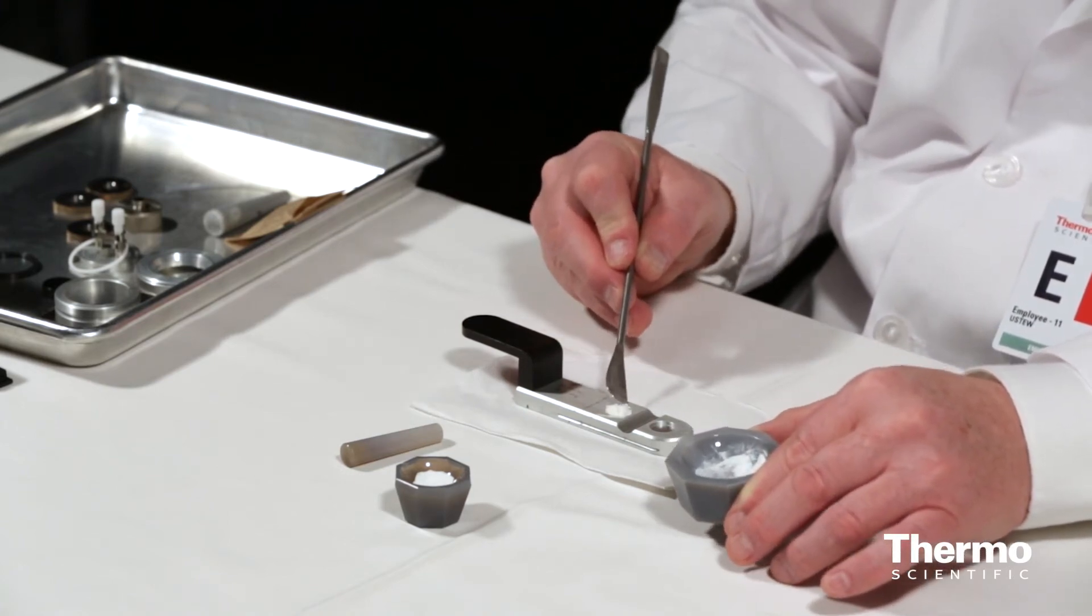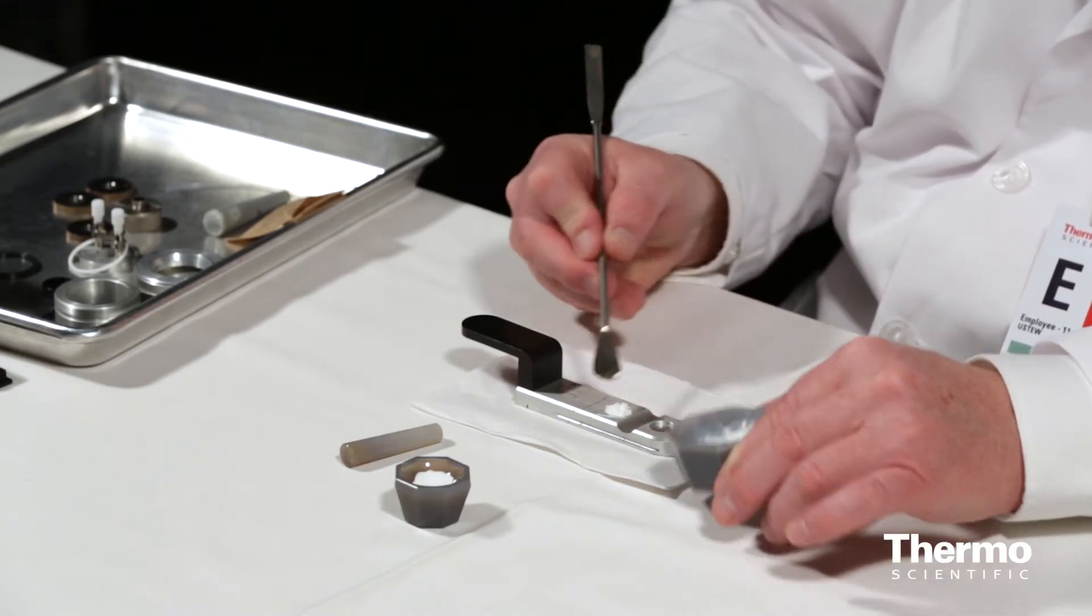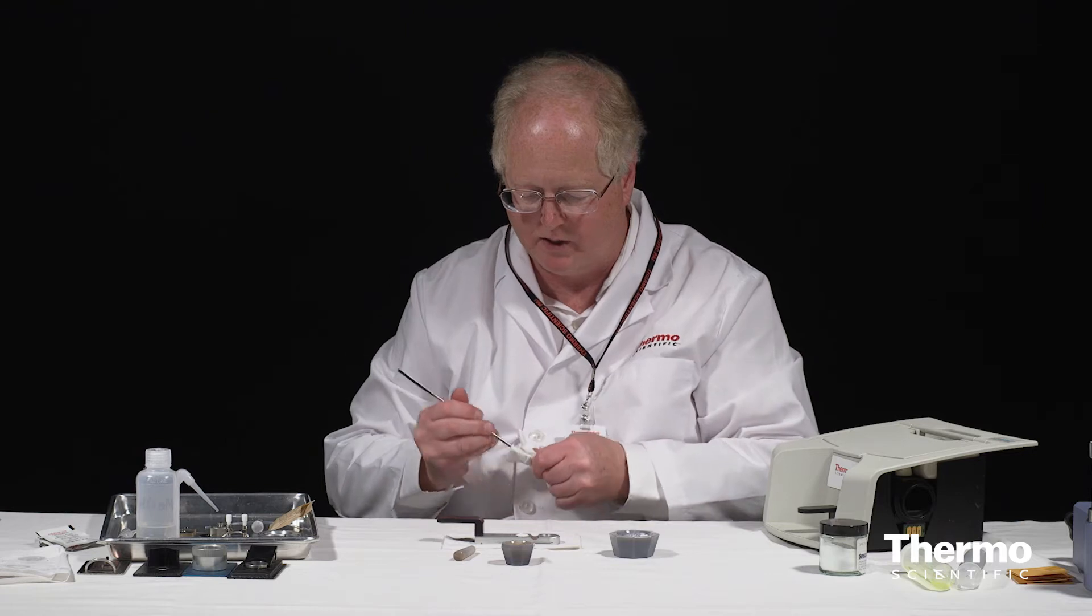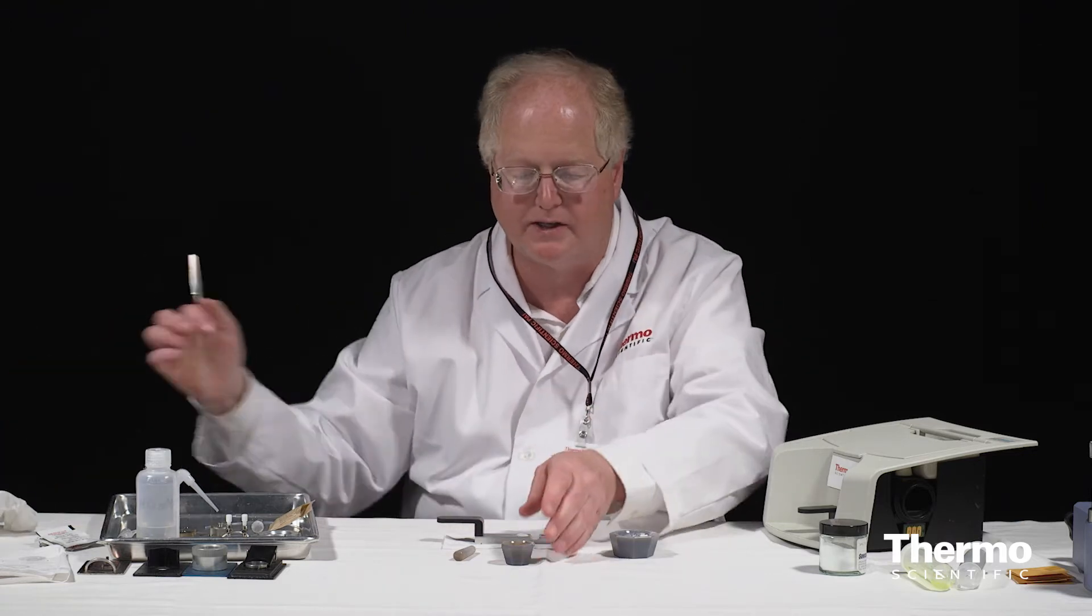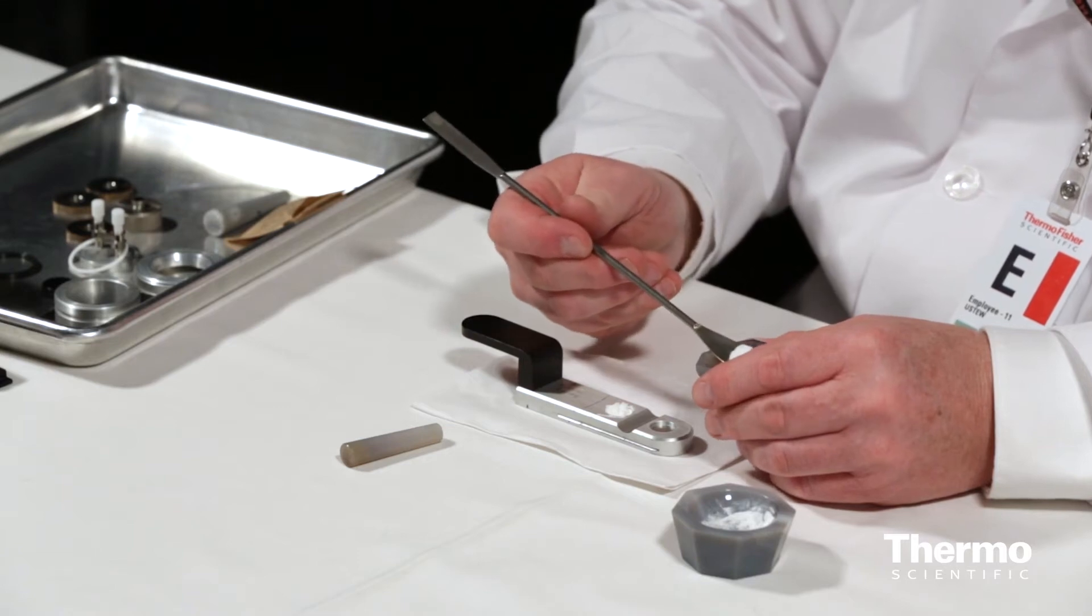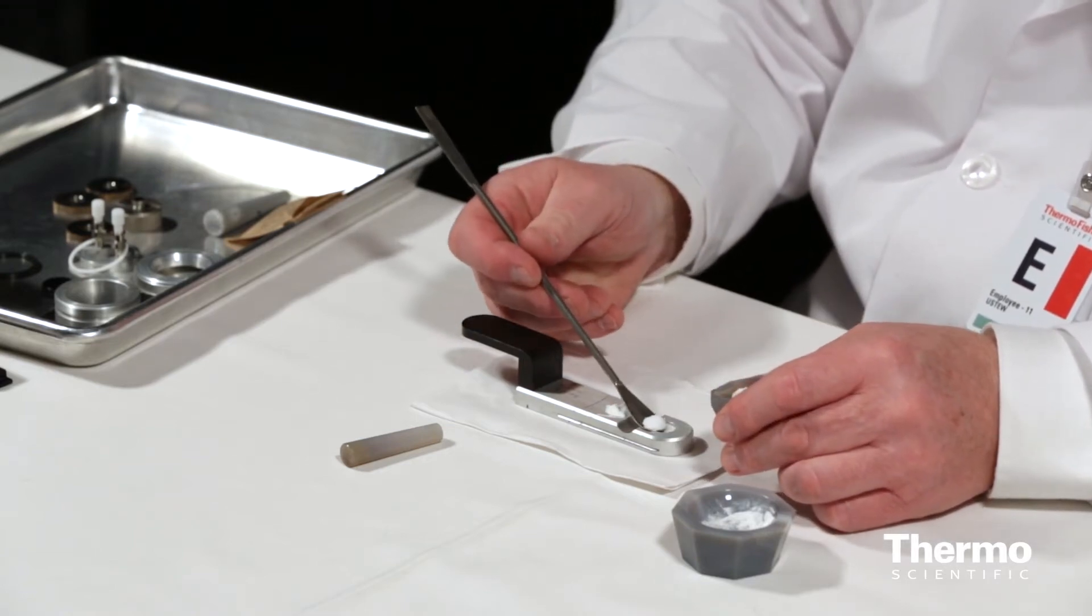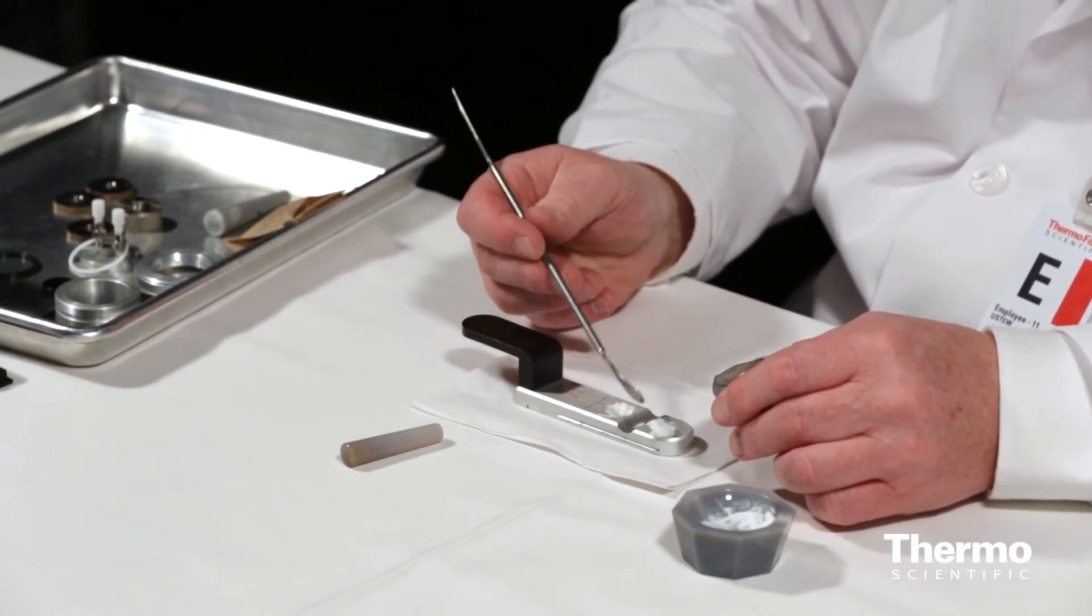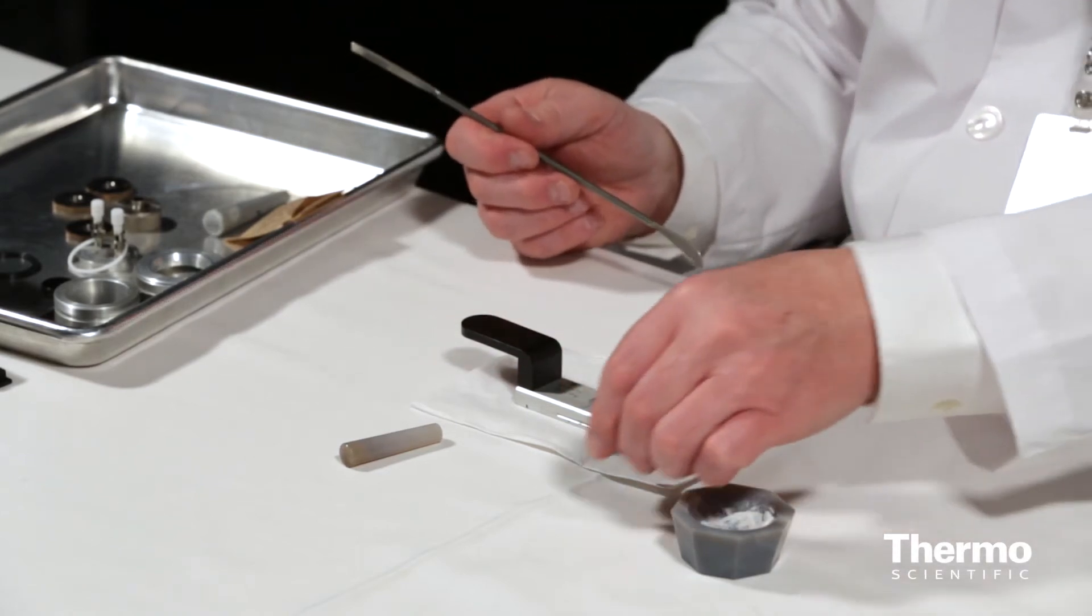And in just a minute I'm going to return to that cup and finish. Then I'm going to wipe off my spatula just because I don't want to contaminate my potassium bromide with samples. So here I have potassium bromide. I'm going to put that in the front cup.